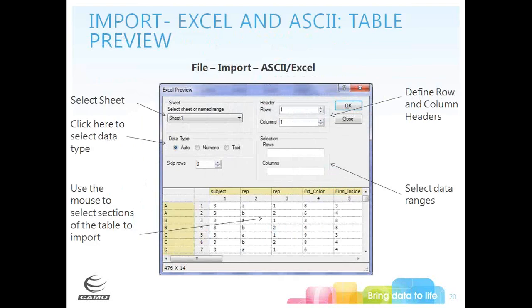When importing Excel or ASCII data, you get a table preview from which you can select the sheet, check the data type (numeric, text, or auto-detect), how many header rows to skip, and the ability to select specific rows or columns by typing or by highlighting within the preview window.